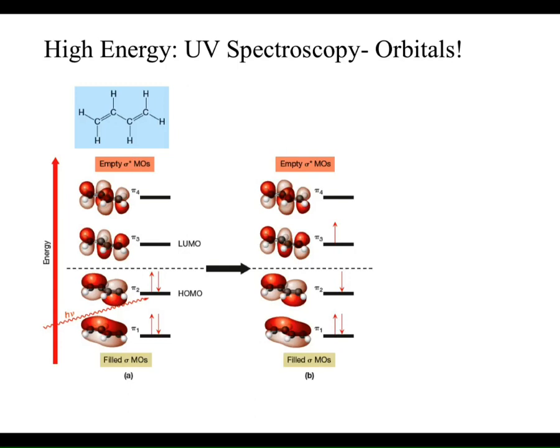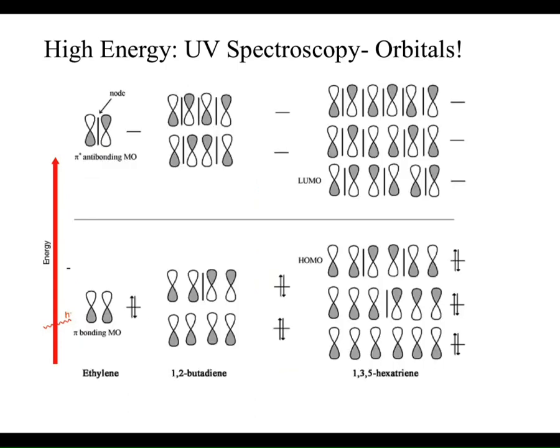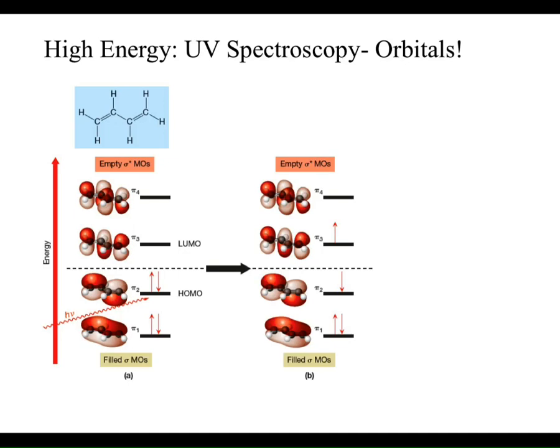They're just orbitals that are jumping around. In this case, what we are referencing, or the most likely transitions, are your pi systems, and that is because the pi systems have the closest gap in energy. Actually, I'll step back a little bit.